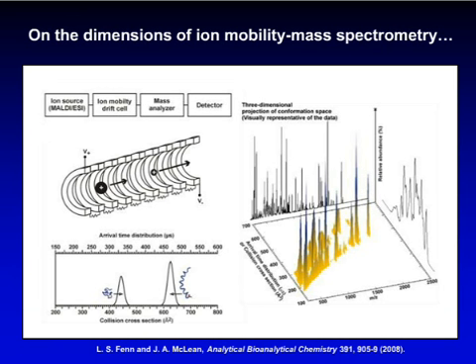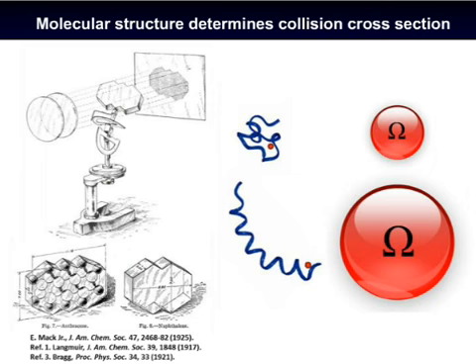Using these uniform or electrostatic drift cells, you can very exquisitely measure the cross-section, in squared angstroms, of the molecule and interpret those structures in a structural biology way using molecular dynamics techniques. The first person to demonstrate this was Ed Mack in the 1920s.